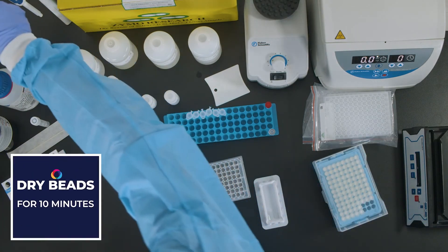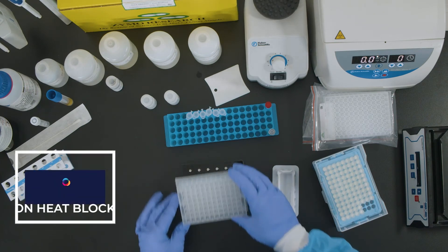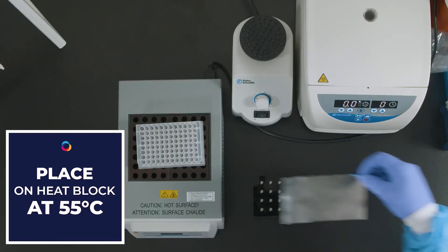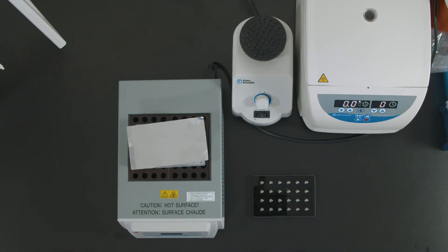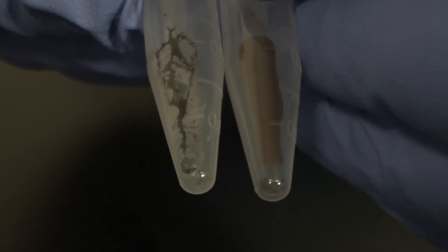Dry the beads for 10 minutes or until fully dry. Place the plates on a heat block at 55 degrees Celsius. Place a seal without removing the sticker over the plate, allowing drying to occur — there must be airflow into the plate for drying to occur. Once the beads are dry, they should turn from a glossy black to a dull brown.